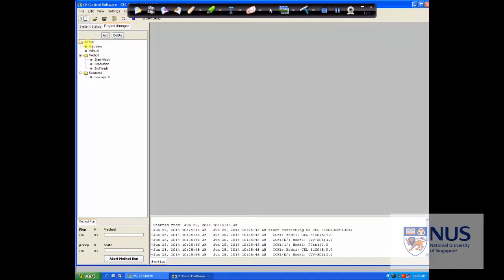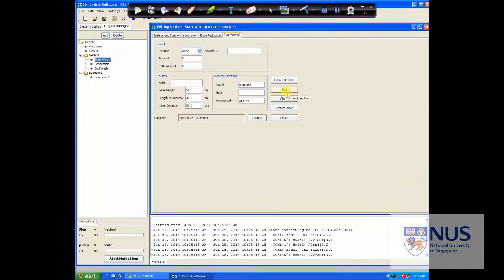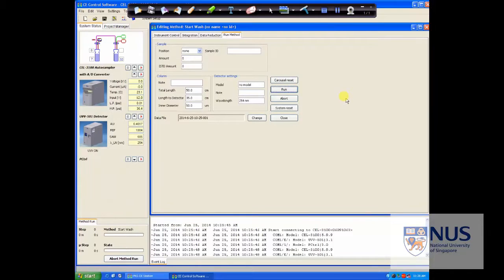Okay, I'd like to pause for a moment now and actually walk around the screen. I'm looking at the left hand side of the screen. There are 2 tabs. One says System Status and one says Project Manager. And you can see now you've clicked the 3292 method file. That little cartoon at the top is actually active, it's moving. That shows you what the system is actually doing.